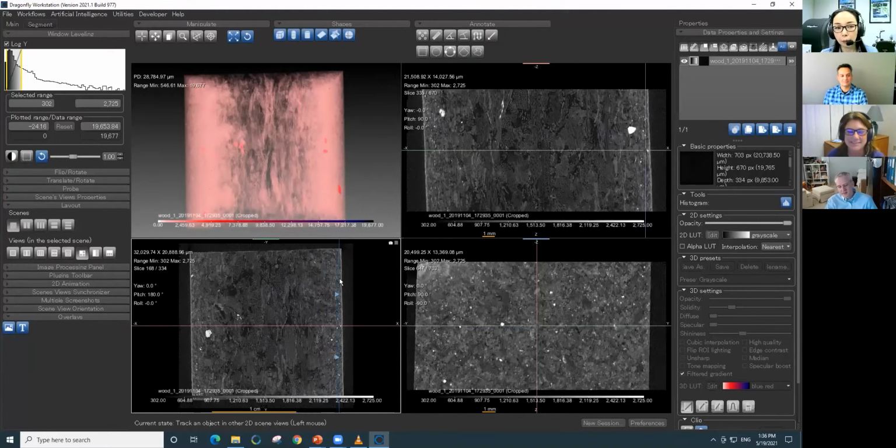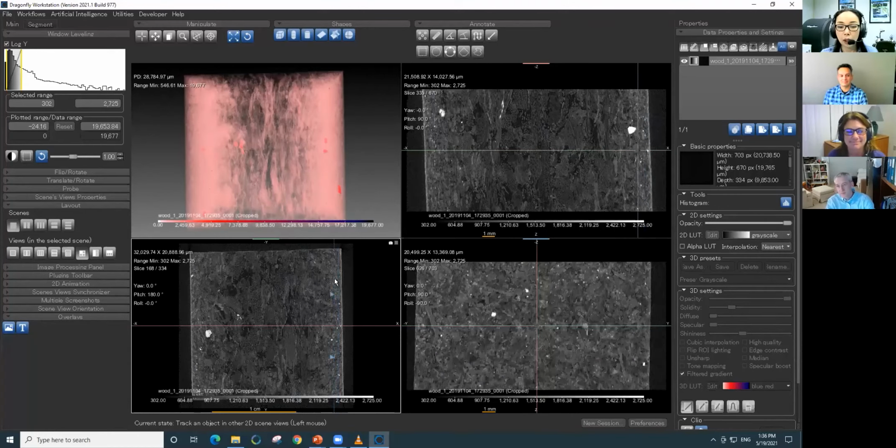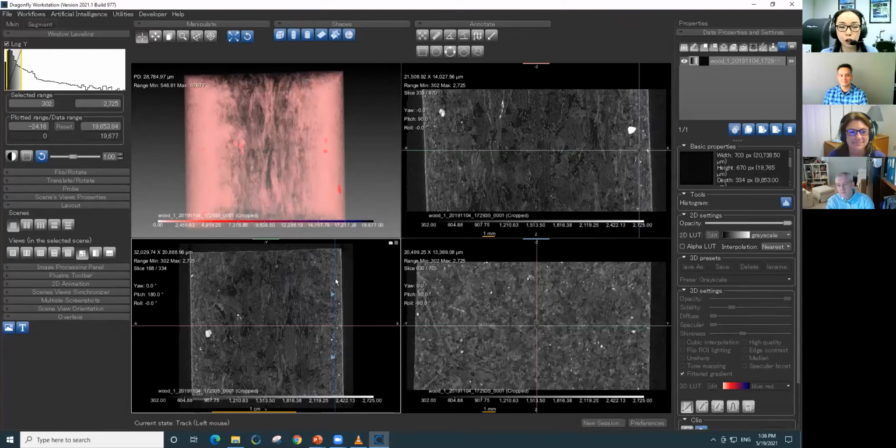And then when you see something like this, one of the analyses you might find interesting to do is to see the change of packing density across this line. So let's say that that's what we want to do. And again, we're going to ask you how we should do it.